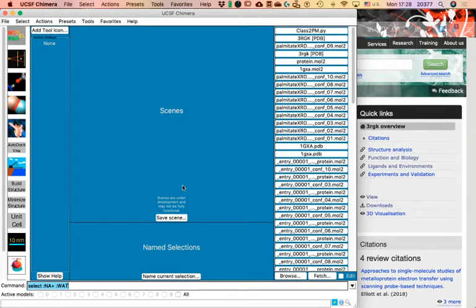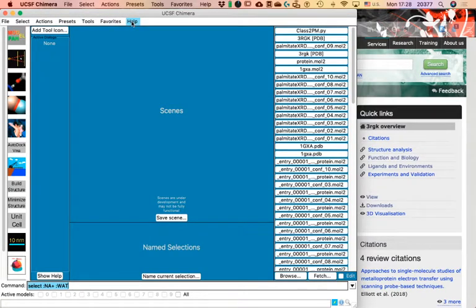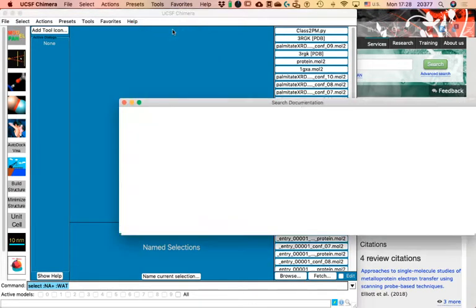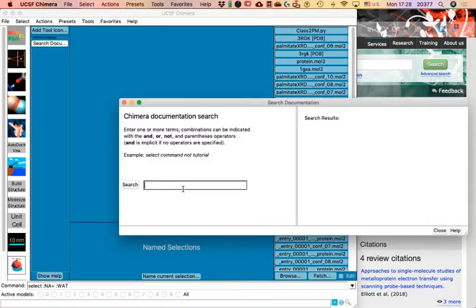If you open Chimera, it probably won't look like this unless you customize it a lot. But you should be able to identify the same menu items on top: File, Select, Actions, Presets, Tools, Favorites, and Help. Help is actually very useful — unlike Windows, which opens a useless help page, this takes you to the actual website. For example, if I click 'Search Documentation' and search for something like 'Find Bonds,' I get very useful results.